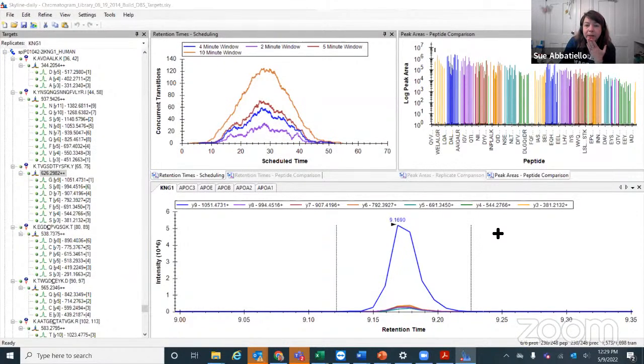If doing targeted MRM assays on a UPLC triple quad, what adaptation to the instrument yields the most significant increase in sensitivity? Yeah, you can do microflow on modern UHPLCs for sure, or even higher flow. And it really just depends on if you can detect the thing that you're looking for. And the important things here are chromatographic resolution, narrowing the peak. So columns that use super small beads will always have a good resolution effect, like less than 2 micron particle beads versus columns that use 3 micron. Their peaks will be broader under the same chromatographic conditions.